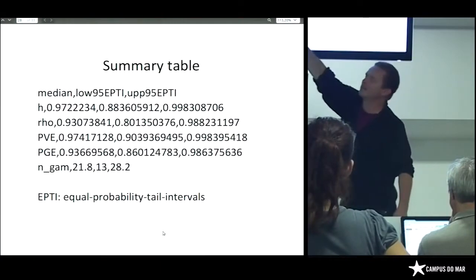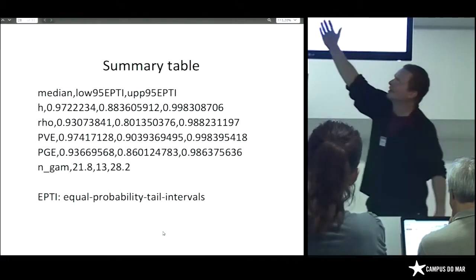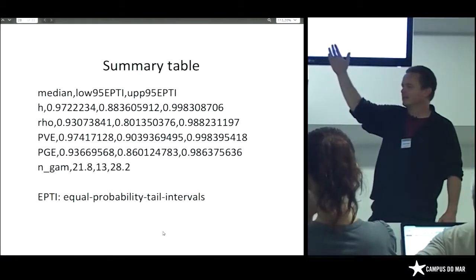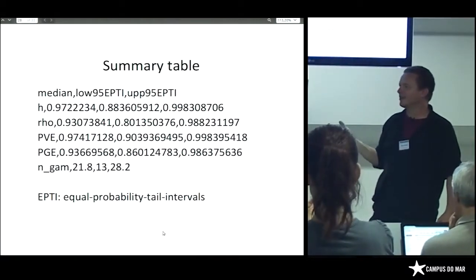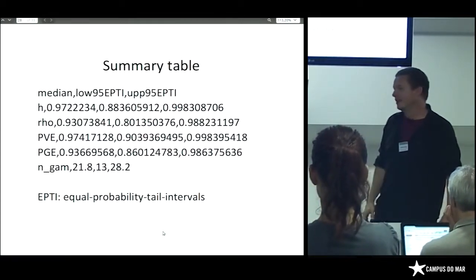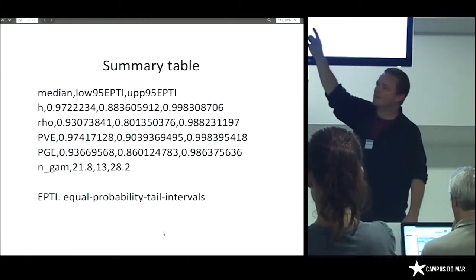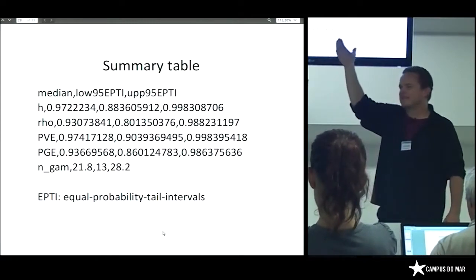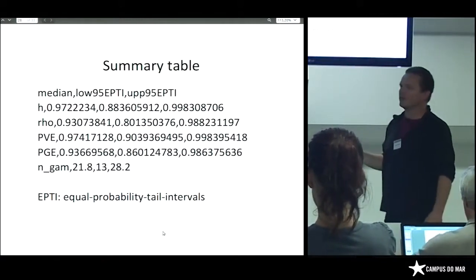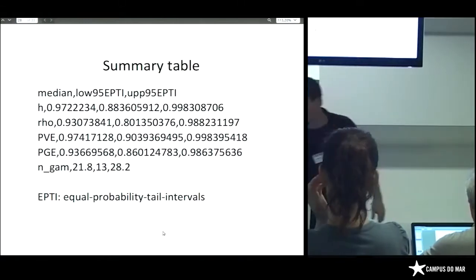I could actually change this table so it rounds to the nearest whole number so that it's a little bit easier conceptually. But the reason I did this is because this is saying we can explain 98%. Now, unless you're dealing with a single SNP of a massive effect, like sickle cell anemia, I think this is wrong. And I would caution always, if you can explain more than 60% in total, you've either done a very tightly controlled cell culture experiment, or there might be issues with the way you've run your model. And we're going to come to some of those in a second.